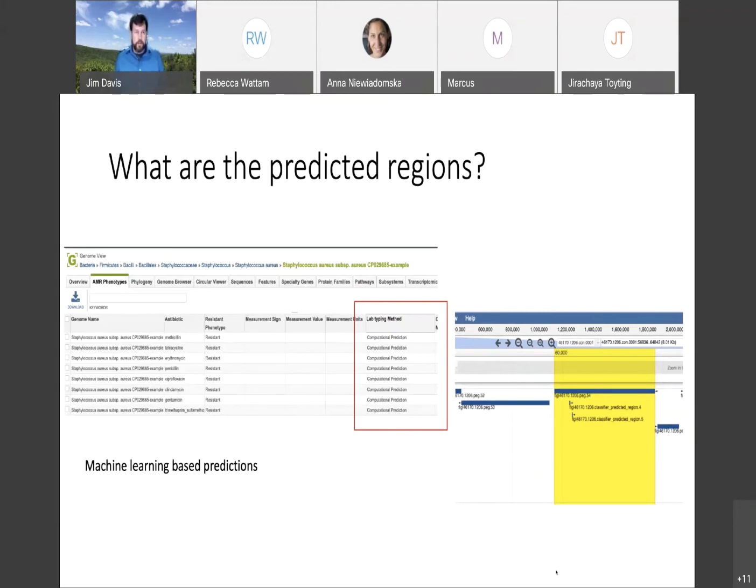And unless you're in some fringe of annotation situation where you're looking at something very specific to RAST, you'll get the same thing at PATRIC. And then if you run it at PATRIC, then you get the comparative analysis environment of PATRIC that comes along for the ride.